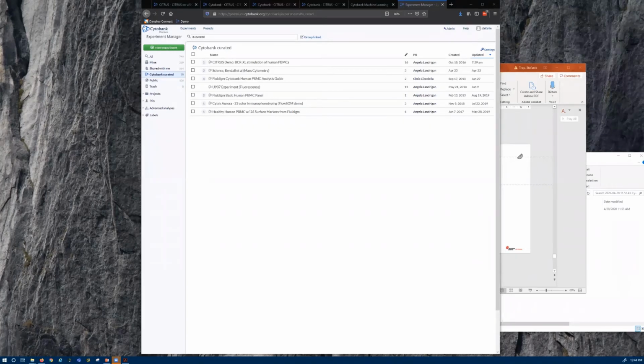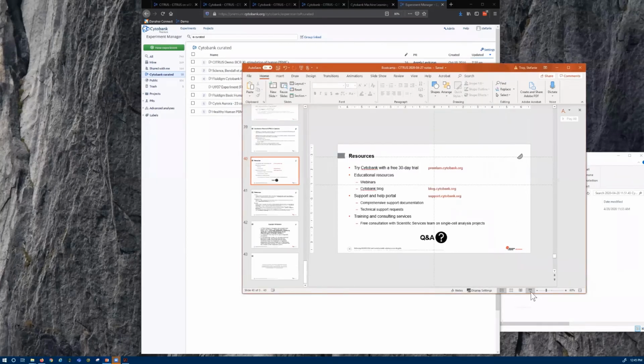And yes, you can run Citrus with those kinds of data sets. But again, you should not use Citrus to analyze your bulk RNA-seq data, because Citrus is a tool for analyzing single cell data sets. You cannot use it to analyze a bulk sample, those kinds of data. And about data scaling, yes, if you're analyzing non-cytometry data, we highly recommend you turn on the data scaling option. Perfect. Thank you, Chi-Hao.